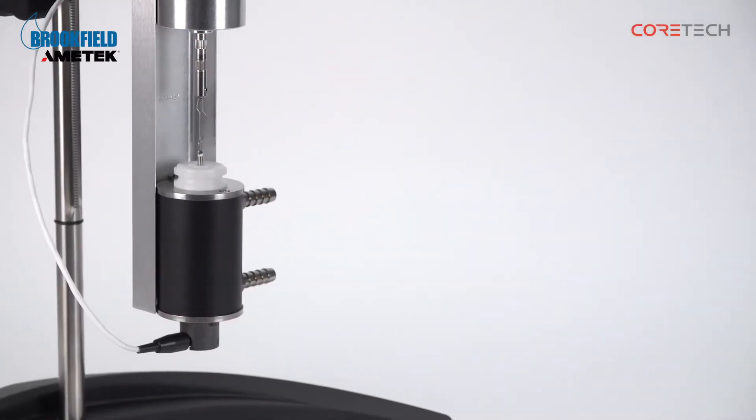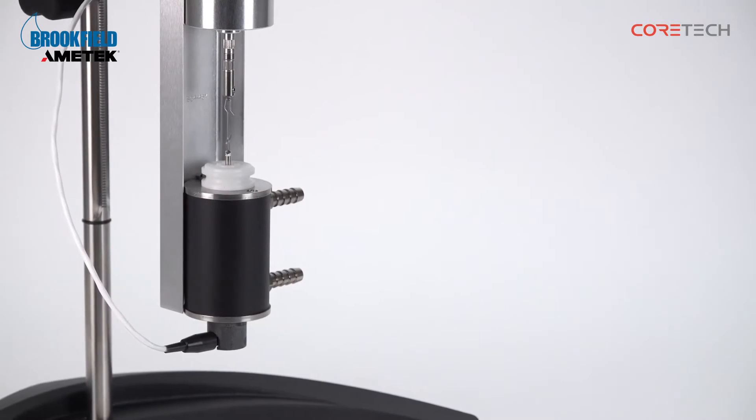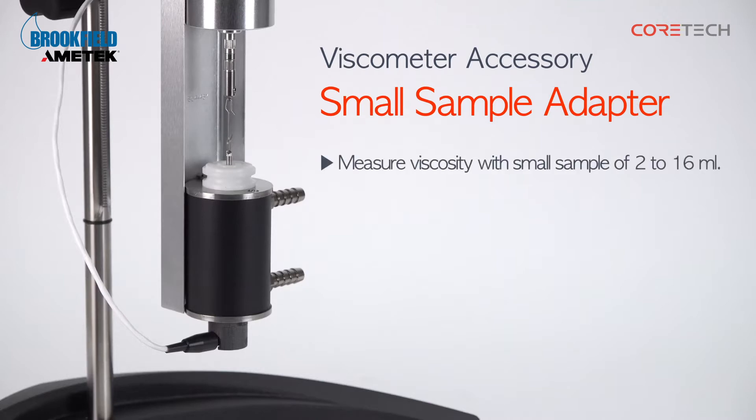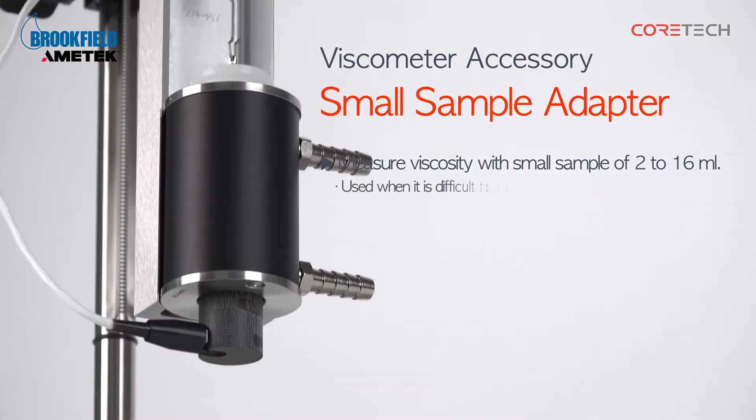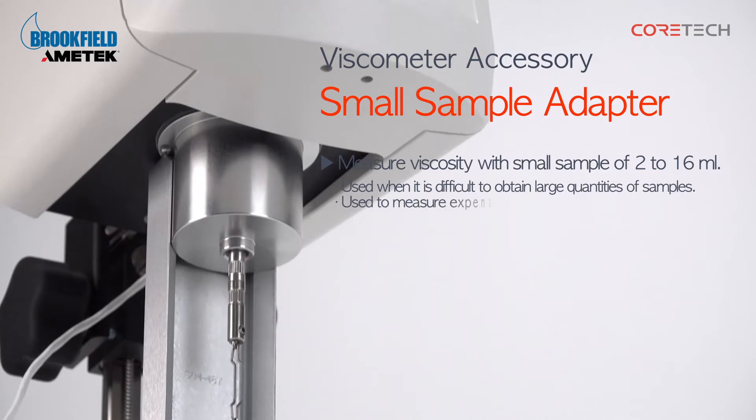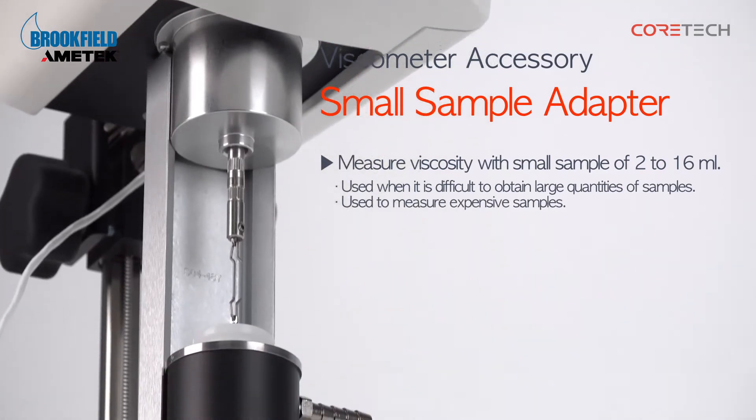Hello, this is Core Tech Korea. The product we're going to talk about today is Brookfield's small sample adapter. Small sample adapters are accessories used to measure small sample viscosity from 2 milliliters to 16 milliliters. They are mainly used when it is difficult to obtain a large amount of samples or when measuring expensive samples.